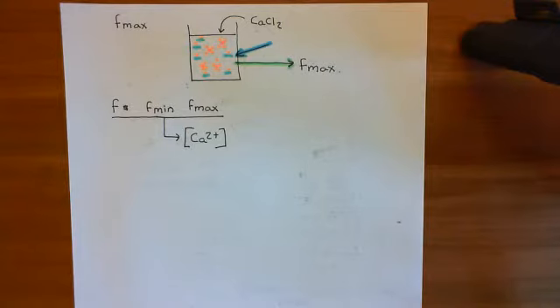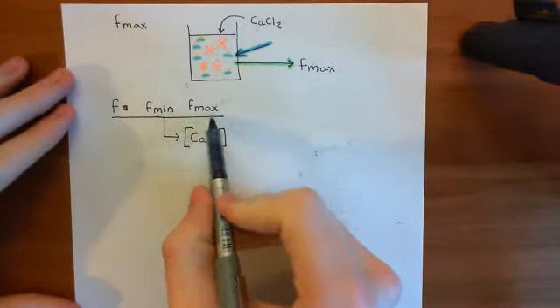Basically, all the Fluo-4 molecules will have calcium bound to them, and therefore the fluorescent properties of that concentration of Fluo-4 now are at their maximum. So we'll shine the blue light at this solution, and we'll get some large intensity green light coming back, and we'll call the intensity of that Fmax.